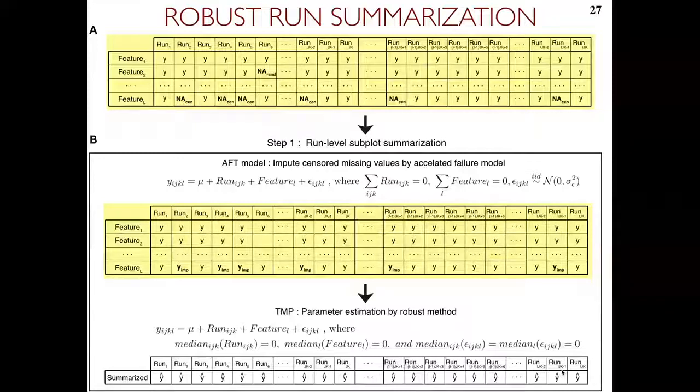When you're doing the imputation, do you have any sort of thresholding to make sure that you're not imputing these values based on, maybe one or two measurements out of 20, or is there something?